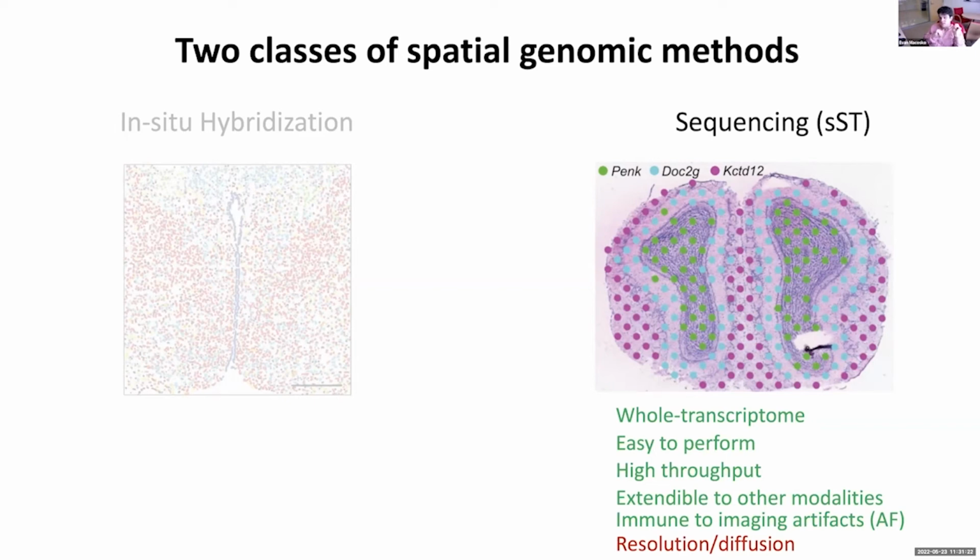It also creates important challenges for reconstructing the individual transcriptomes of individual cells. So that's something we just have to be aware of as we do our analysis, and also as we think about the differences amongst different technologies.